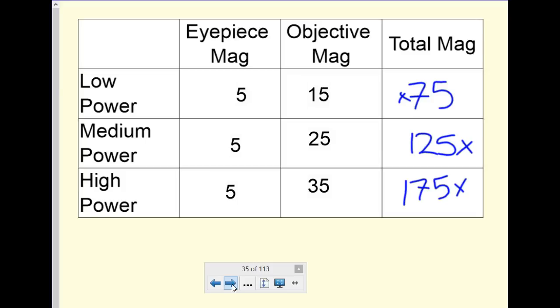You are going to be looking at the inner skin of the onion. Not the outer skin, it's very hard to see the cells. You want to take the scale of the onion and bend it away from your eyes, otherwise it's going to make you cry. When you hear that snap, that means you've broken the outer scale. Pull the two apart and get this lovely transparent skin. That's the inner skin.